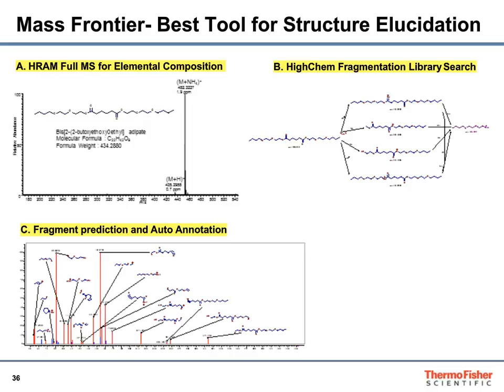So if you have any unknown impurities, as long as you have your MS mass spectra, you can use the knowledge and the information to propose a structure, and then use the Mass Frontier to do the fragment prediction. And the best part is all those predictions, those mechanisms in the software, are actually collected from the published articles, so they are scientifically sound.